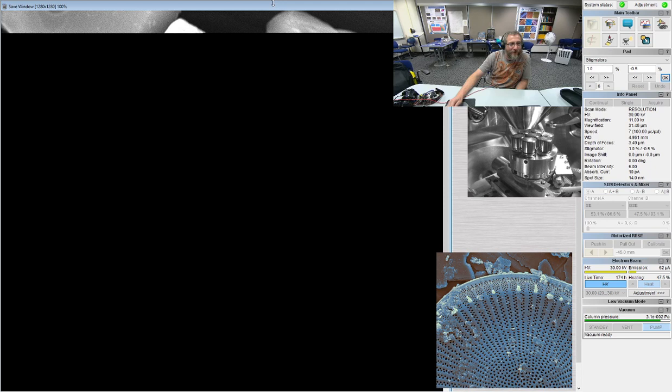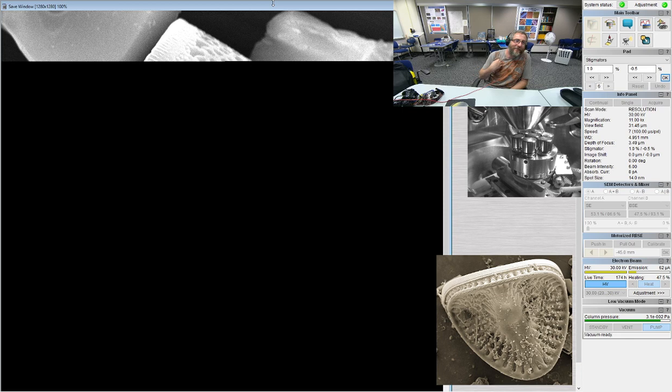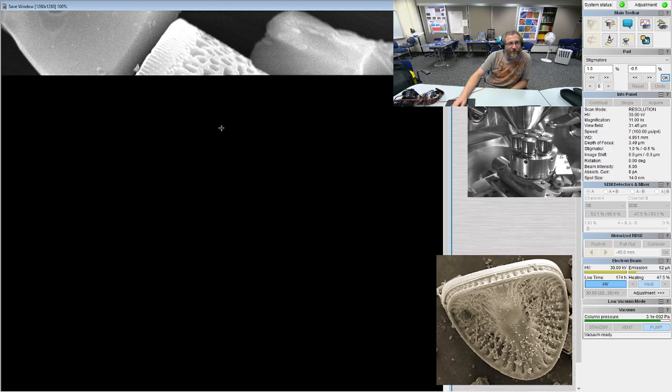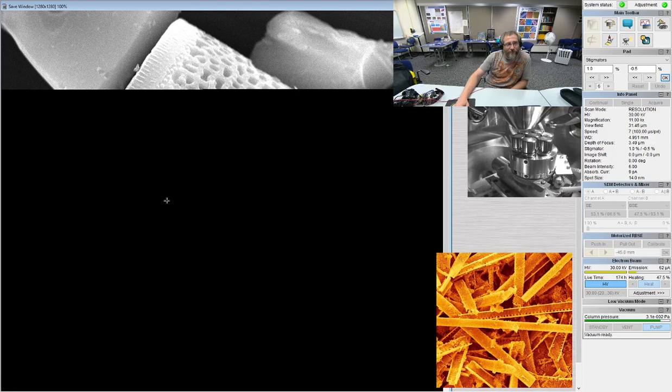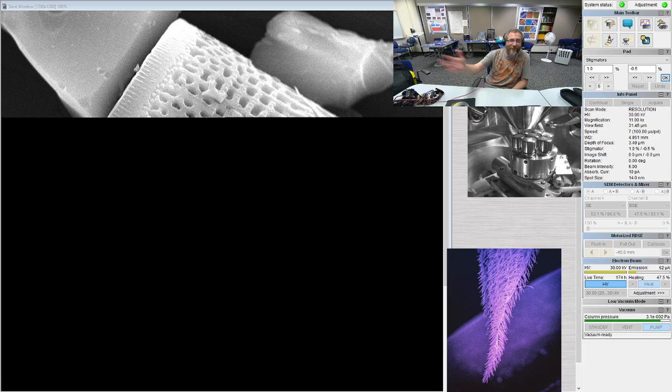Not before being boiled in hydrogen peroxide. You gotta do that. Quite the journey. And then you also did some heavy liquid extraction on these, right? Oh, yeah. It was floated up out of water with a sodium polytungstate heavy liquid. There you go. Risen from the ashes, literally. I like it. We could call all of them something after Phoenix as a result.